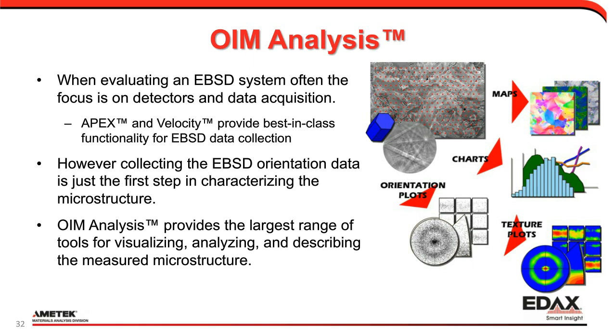Of course, the flip side to having a very powerful and comprehensive package is that there are a lot of features and functionality. So the challenge we've had is how do we make this accessible and make use of it efficiently? One of the first ways we've tried to do that is through what we call our Quick Gen Toolbar. This is one of the toolbars that's available in the software. It offers one-button access to the most common maps, plots, and charts, and we'll go through what comes out of this.